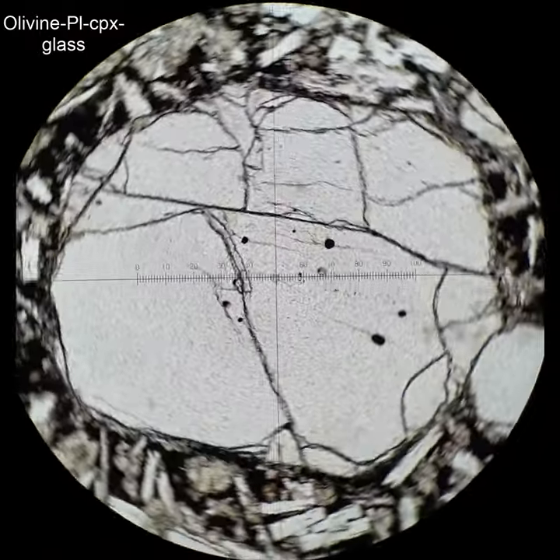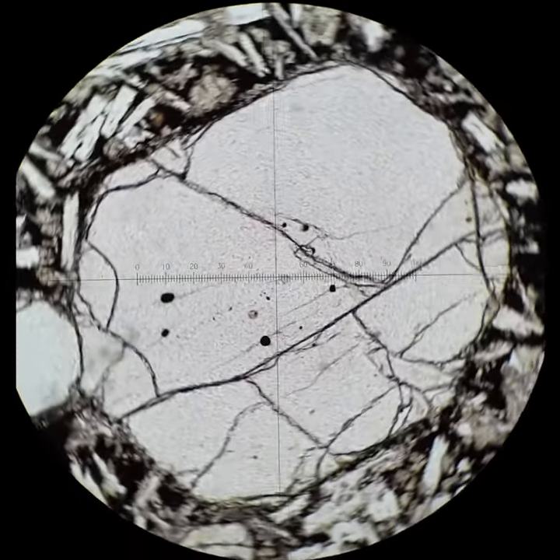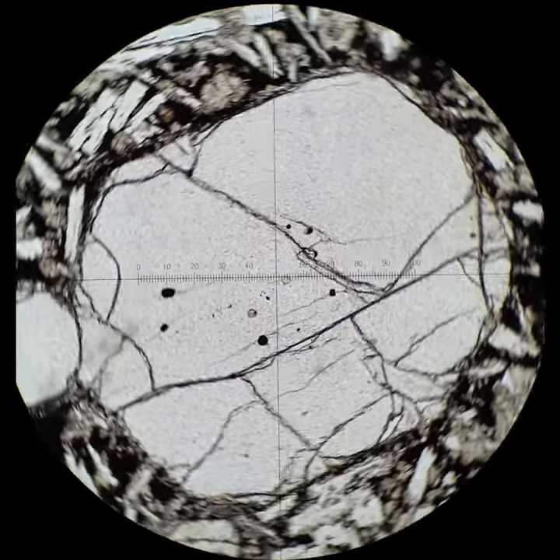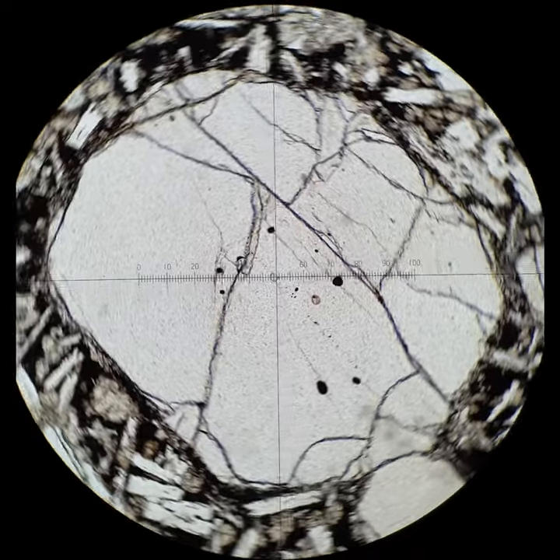A close-up of an olivine crystal. Maybe the hint of a cleavage through there. But you can definitely see the arcuate fractures.